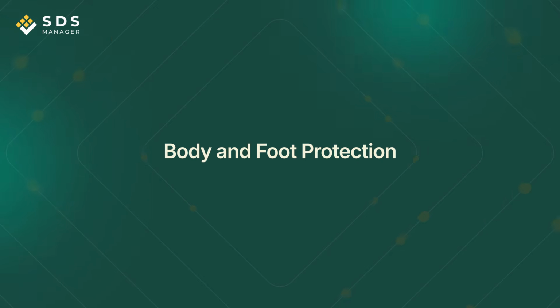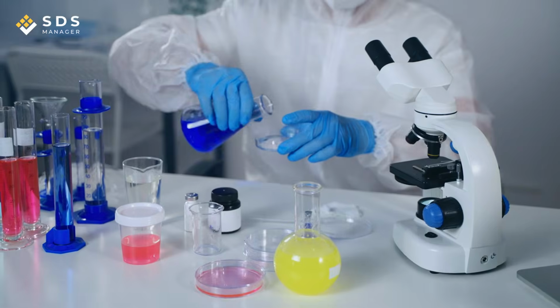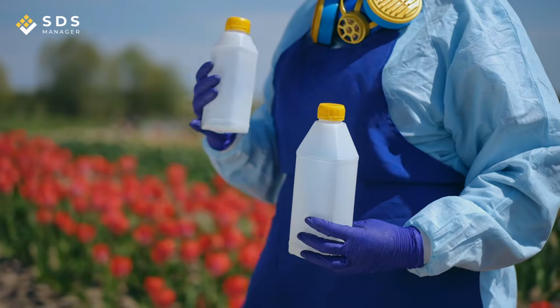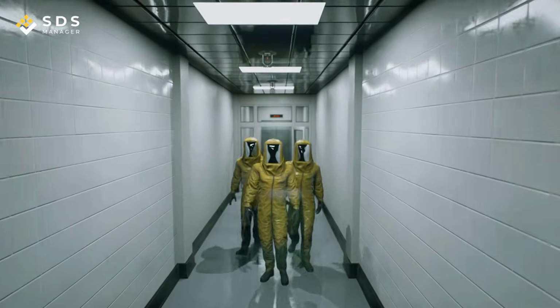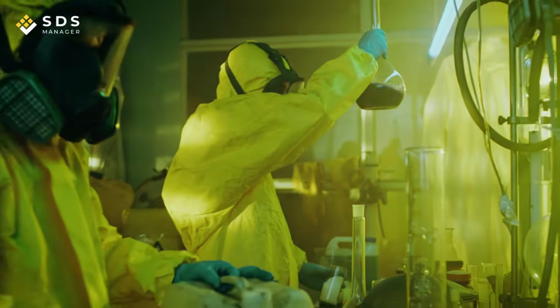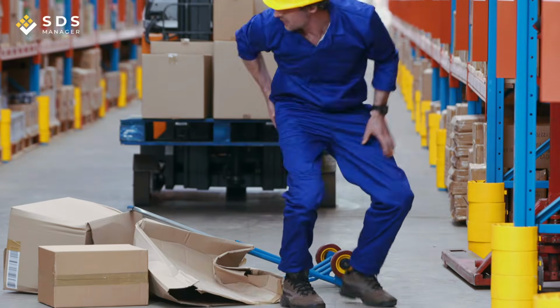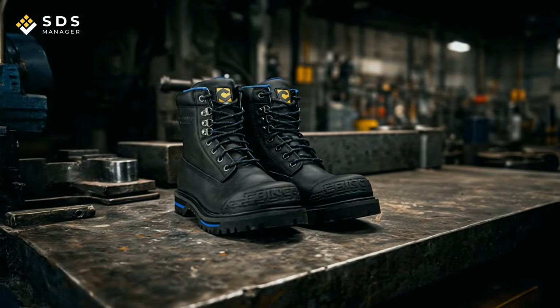Body and foot protection. For tasks involving corrosive chemicals or large volume transfers, the body needs protection beyond gloves. Chemical-resistant aprons are suitable where splash risk is moderate. Full chemical protective suits are used when total body exposure is possible, such as during spill response or handling highly toxic substances. Footwear should be chemical-resistant and cover the ankle at a minimum. If there is any risk of heavy containers falling, steel-toed boots with chemical-resistant uppers are the right choice.